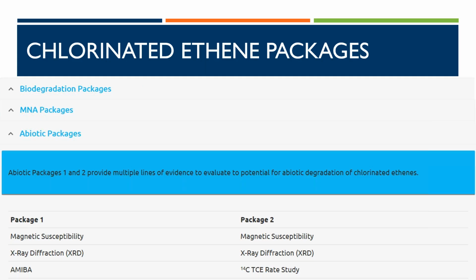This falls in line with the thing that we commonly preach at Microbial Insights, which is looking at multiple lines of evidence. Once you've seen your geochem data and once you've seen your VOC data and you know the history of your site, you might have a better idea of which of these packages would work best for your site. So for example, if you happen to believe that there might be some iron present at your site, you might look at some of these abiotic packages to see what might be occurring in the subsurface of your site.